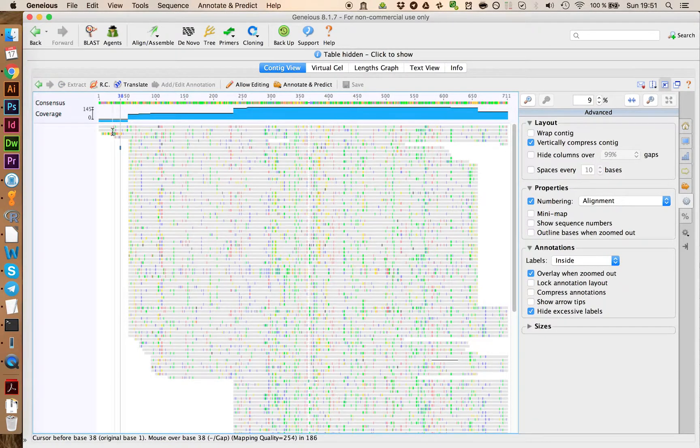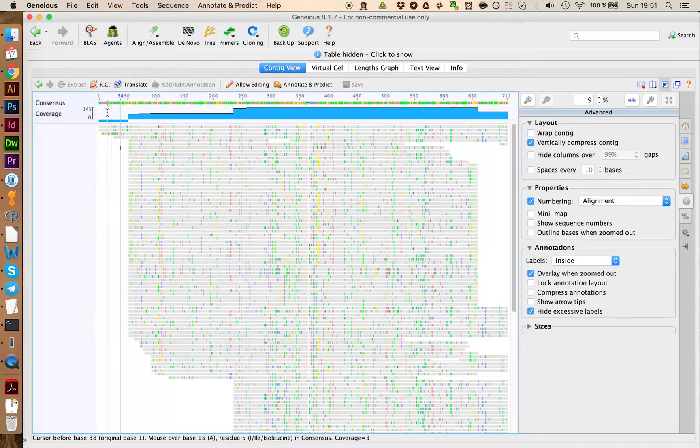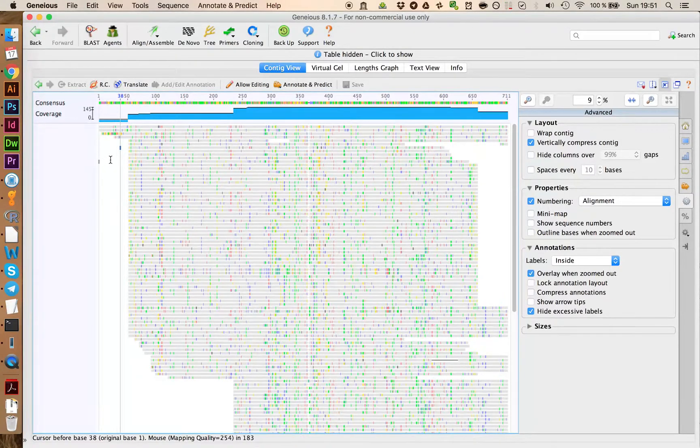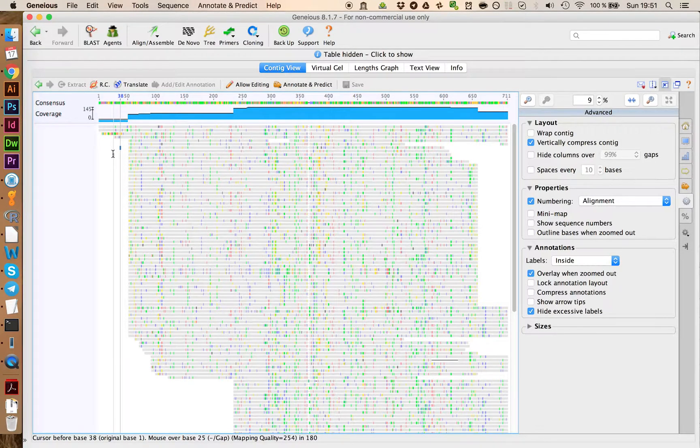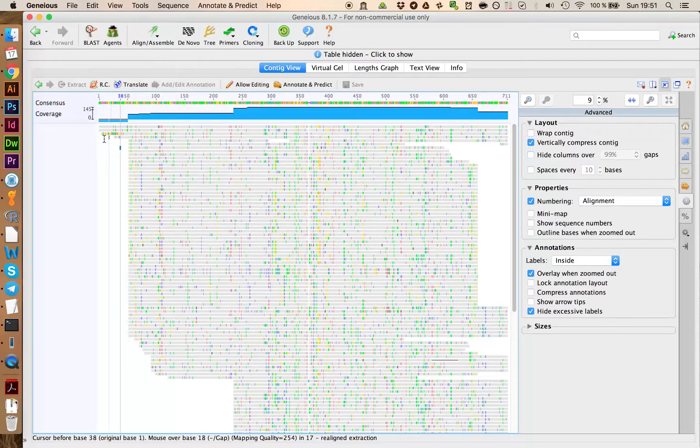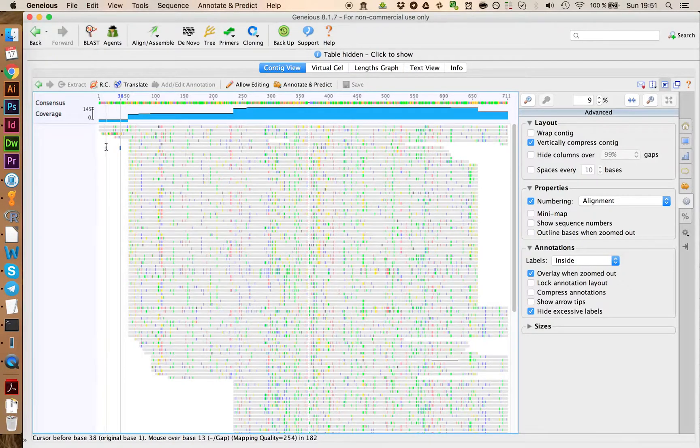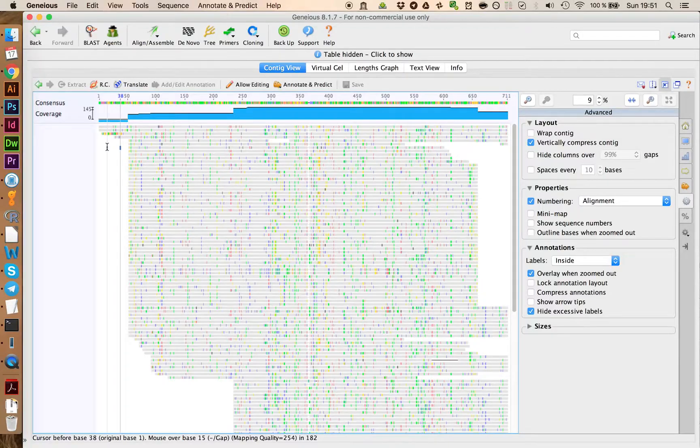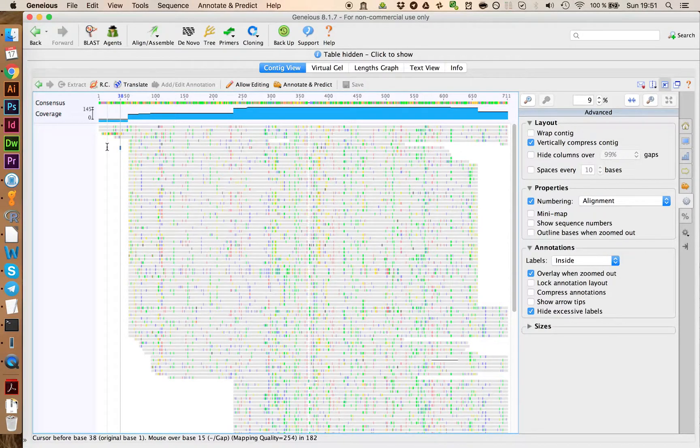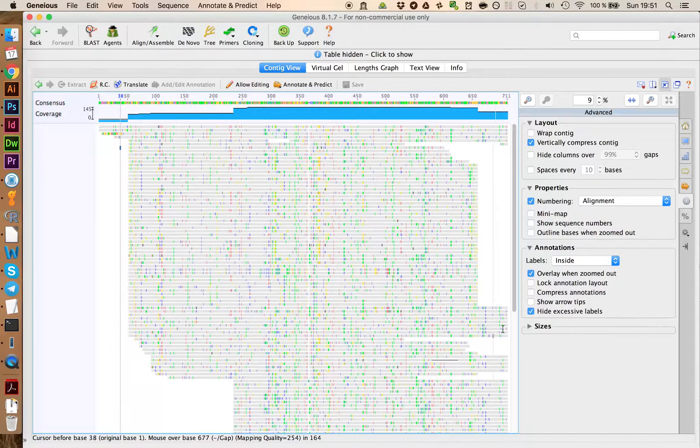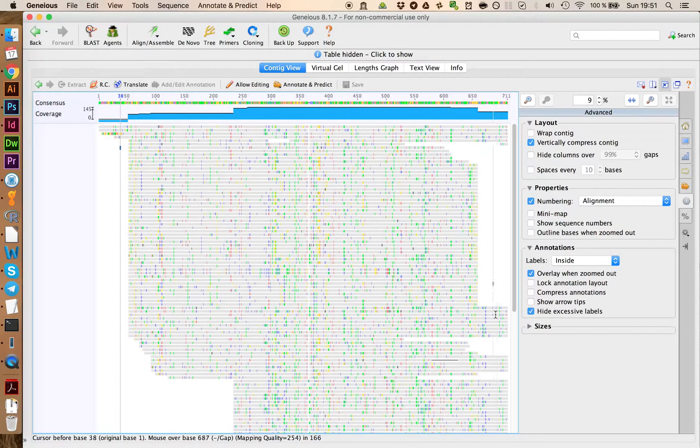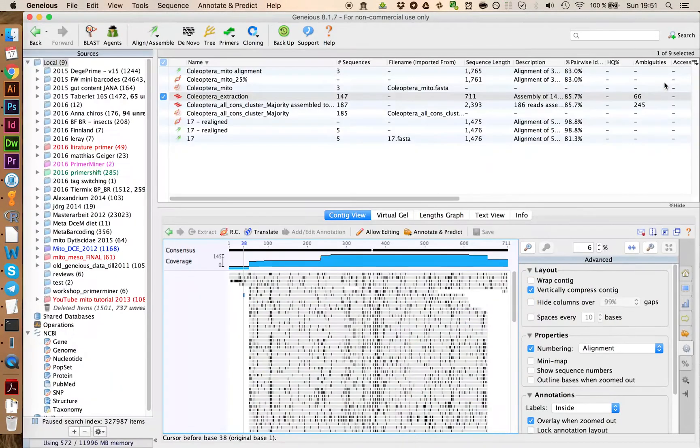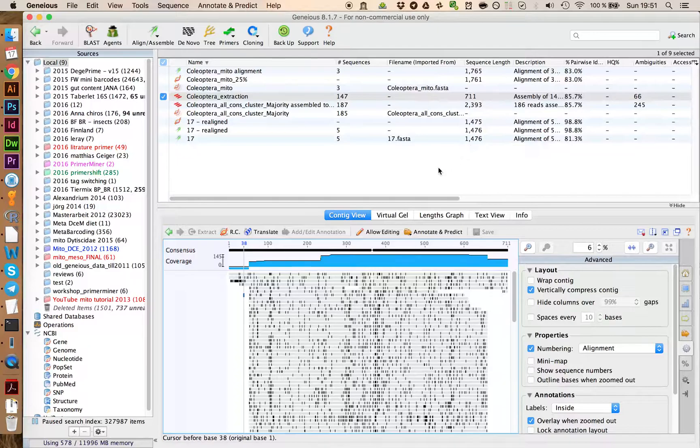You immediately also see that very often the LCO primer here has not a lot of coverage. So it's almost impossible to build improved versions of this primer because there's not a lot of sequence data available, at least in the example dataset we downloaded now. For the HCO side, it most of the times looks a lot better. Let's close this down again.